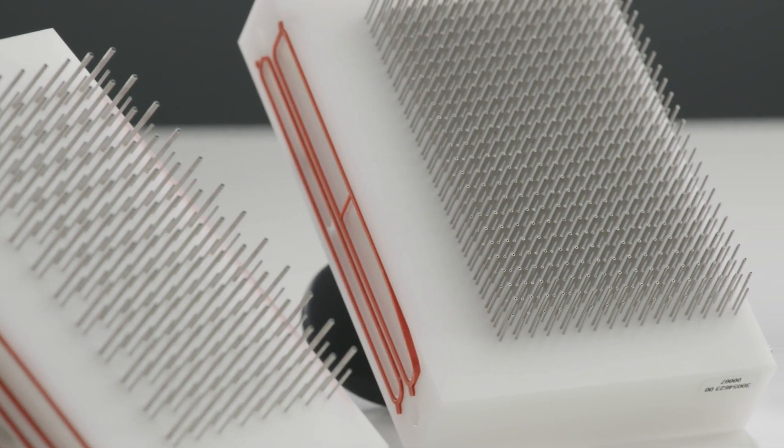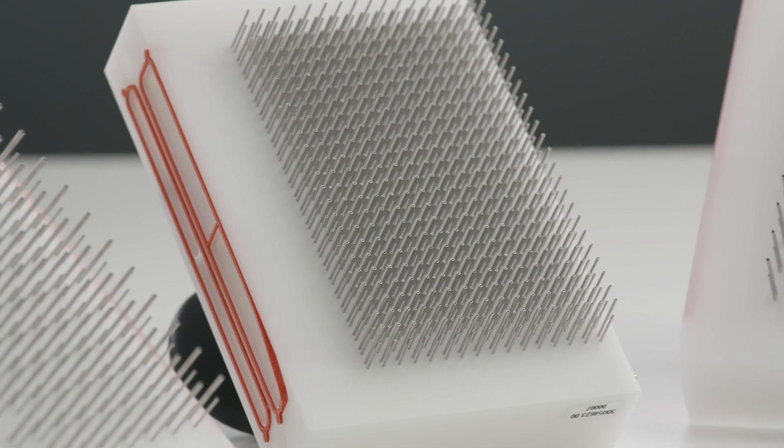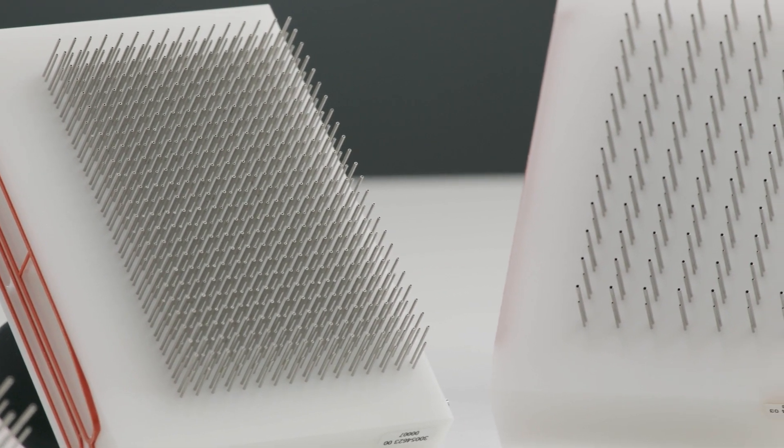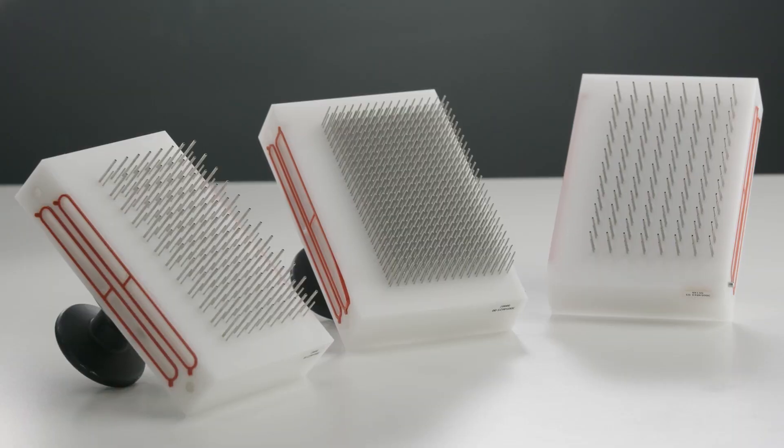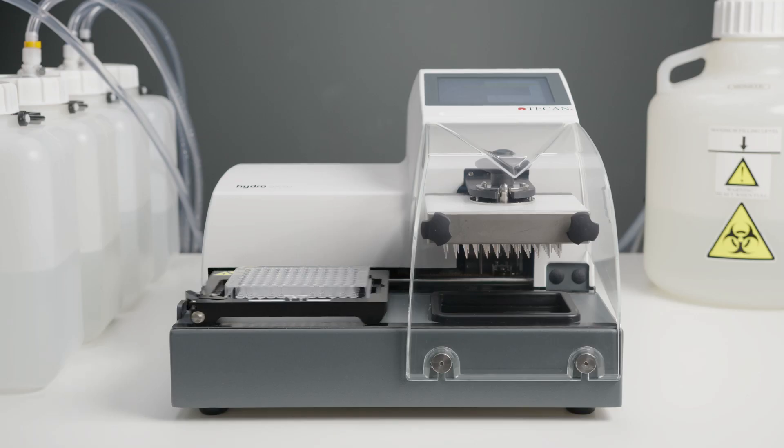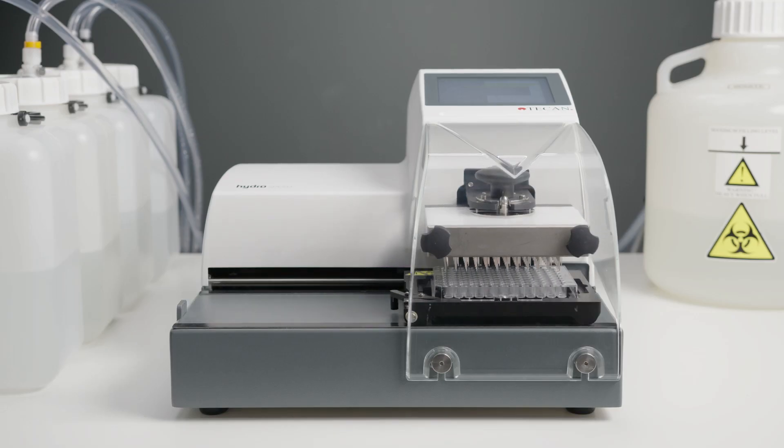The HydroSpeed can be equipped with a 96 or 384 well wash head configuration to process the microplates used in your lab. Plate offsets are the needle positions for the aspirate, dispense and wash steps. Optimization is essential for successful performance of the instrument.